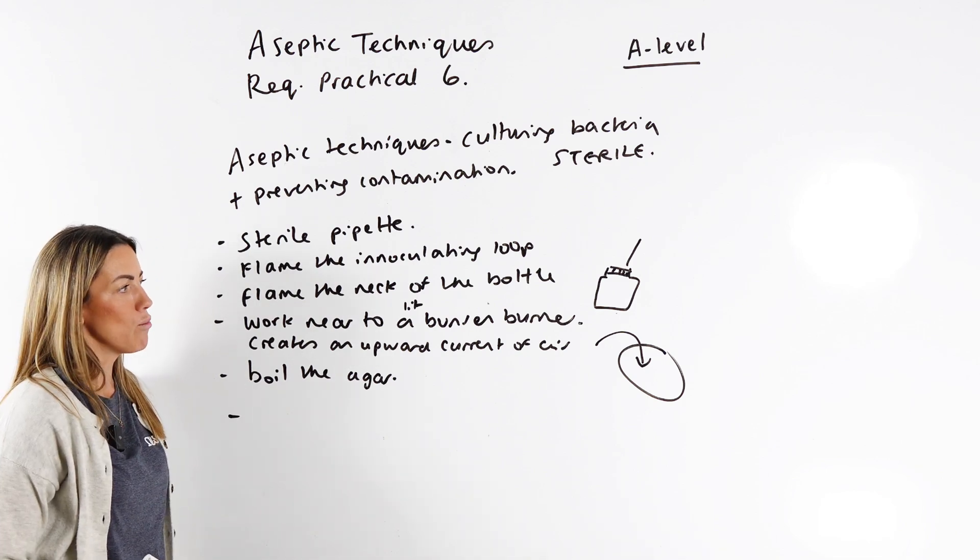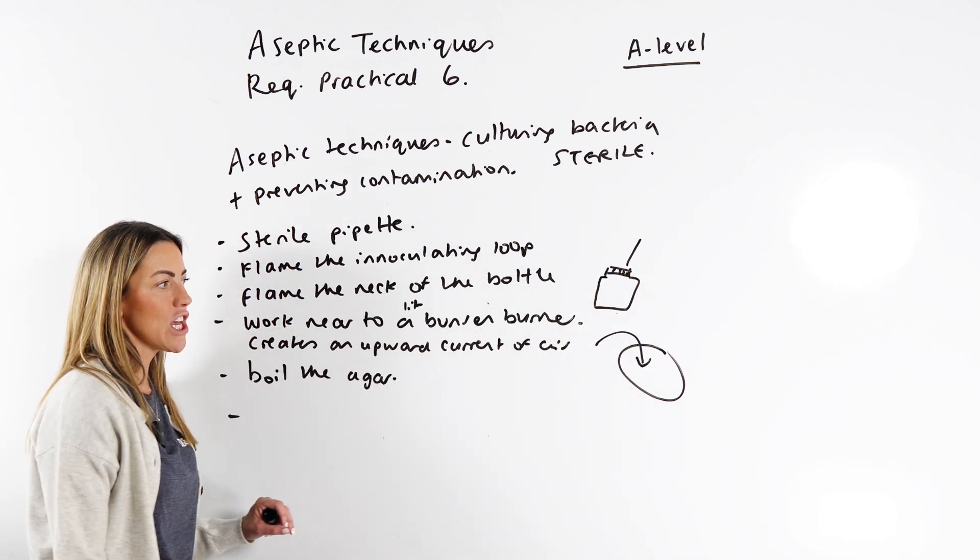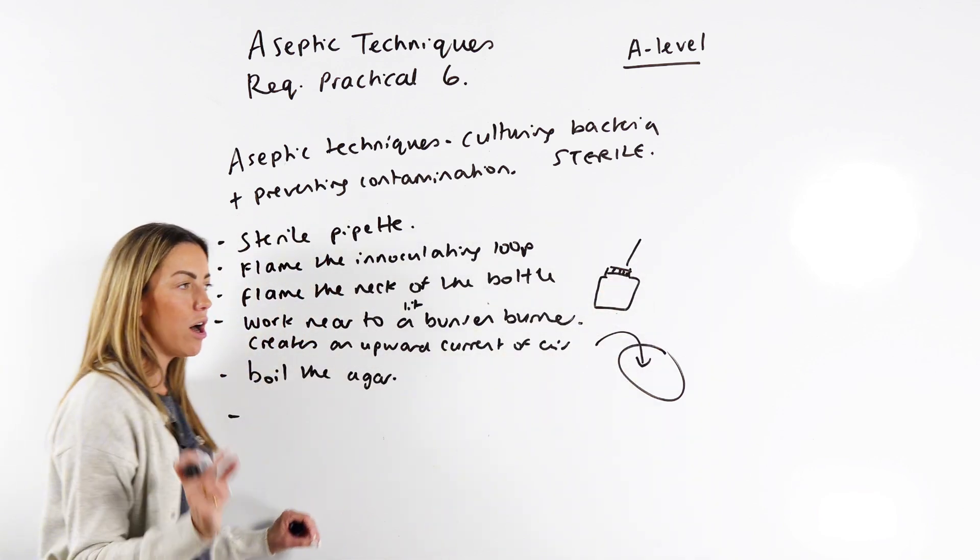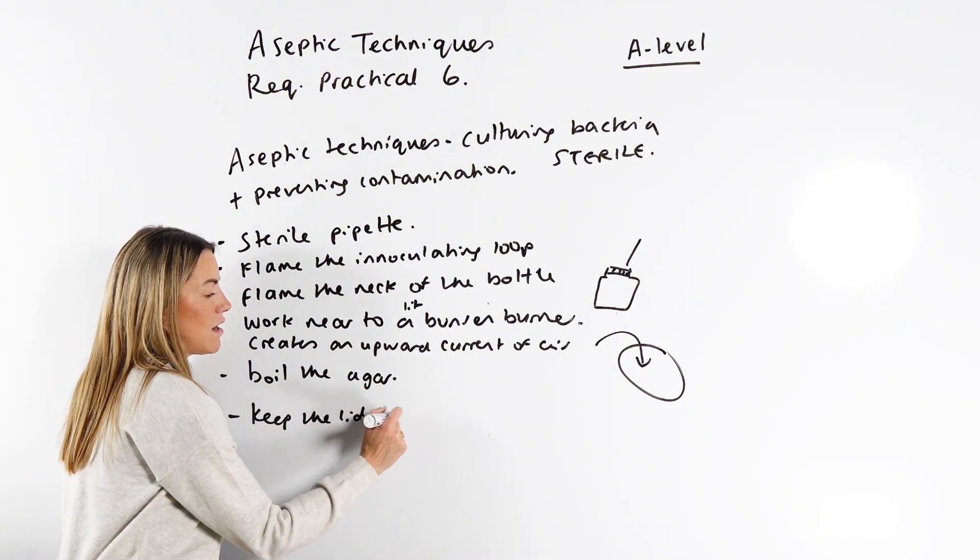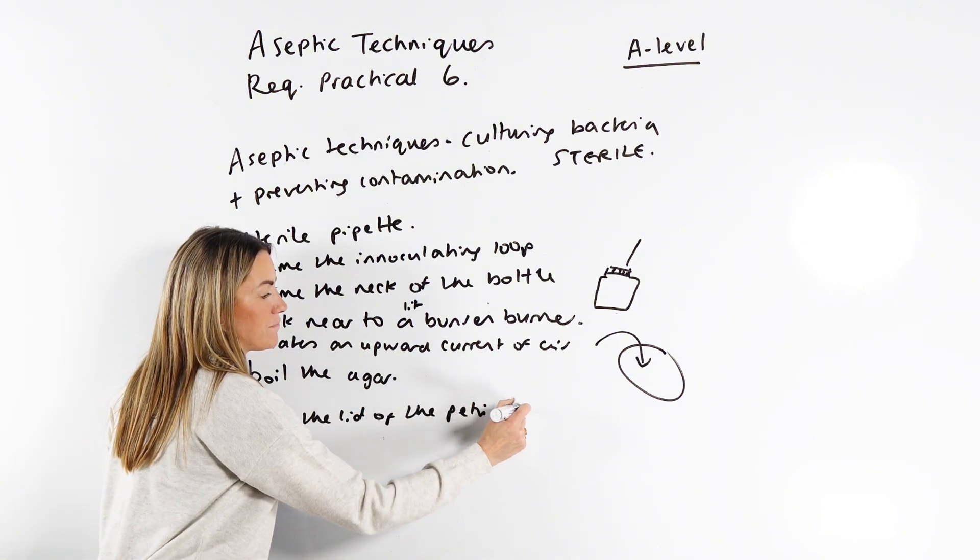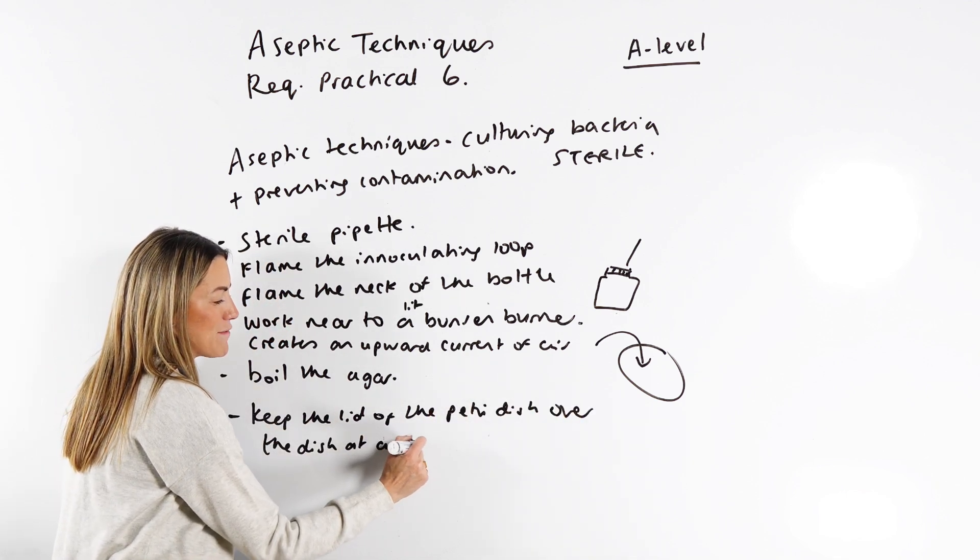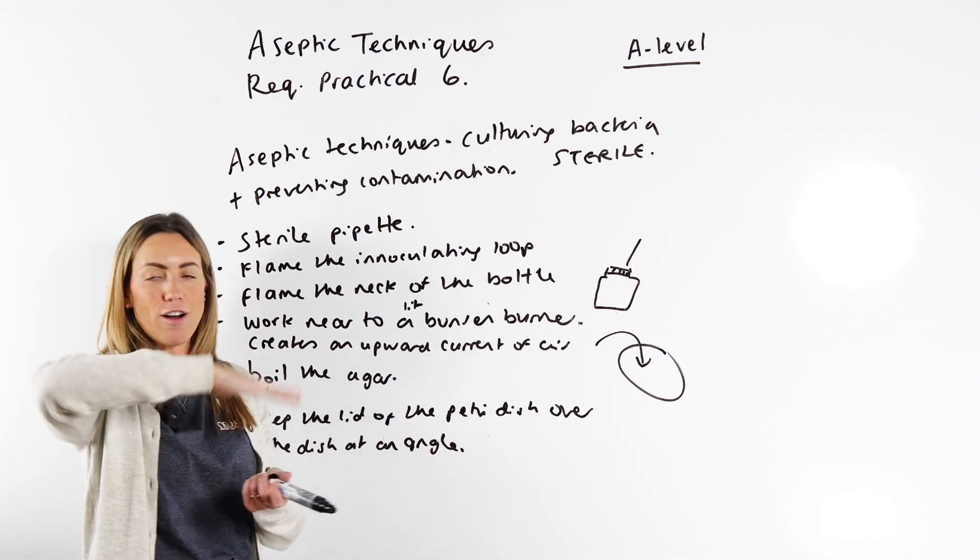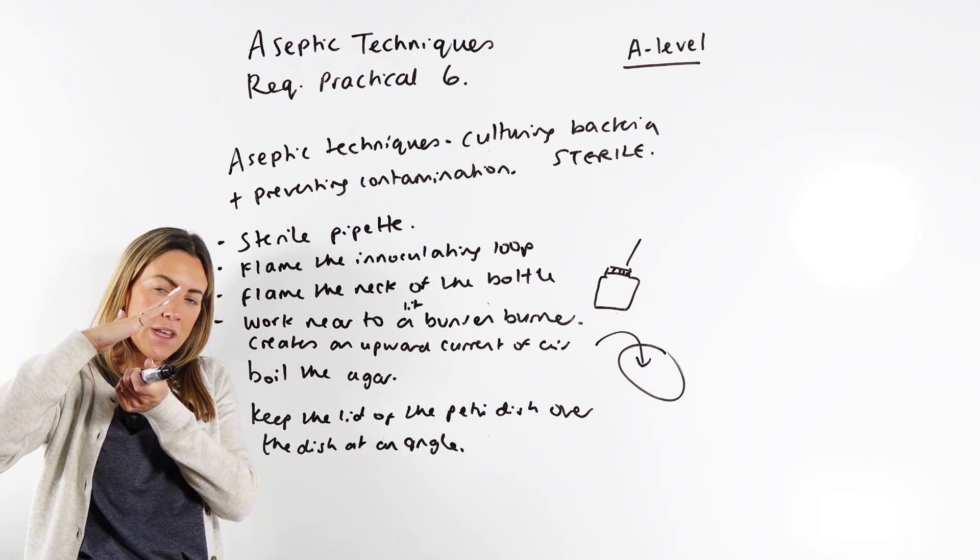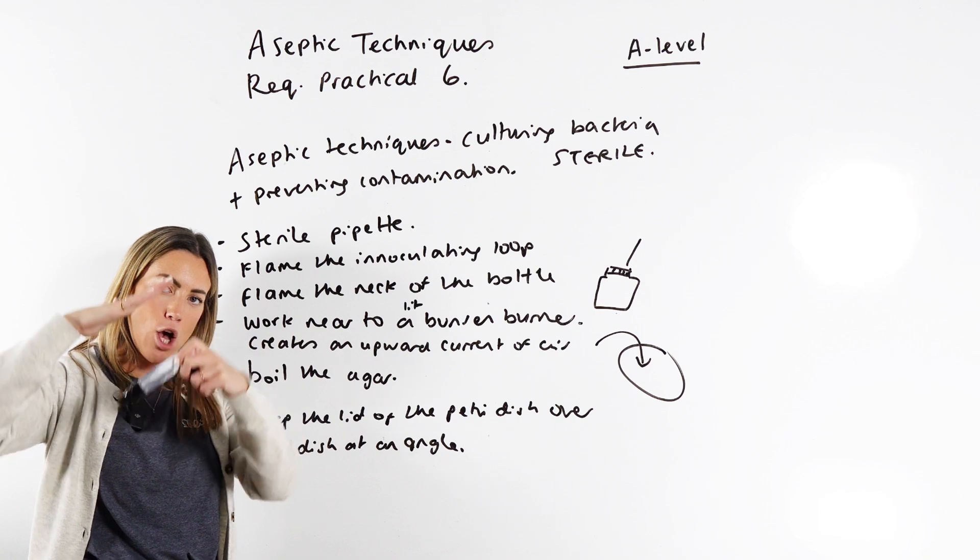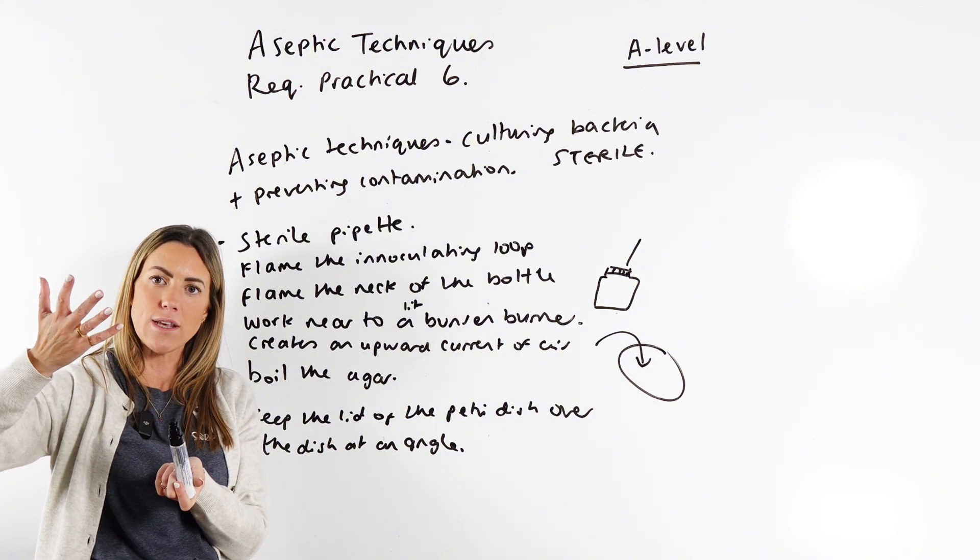Now we're kind of at the point where we've got our sample of bacteria, we've got our agar onto our petri dish, now we need to actually put the bacteria onto the petri dish. When you do this, you keep the lid of the petri dish over the dish at an angle. You're not going to take off the lid and just move it away. You're going to keep the lid over the petri dish at an angle. So you've got enough space to get the bacteria in, but you're still covering the agar. Again, so airborne microorganisms cannot fall onto your agar and contaminate your culture.